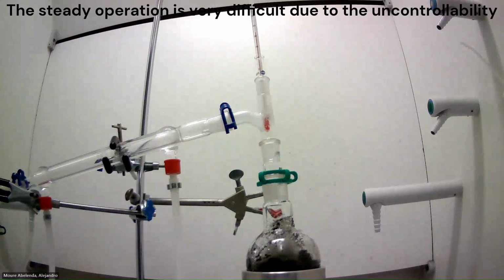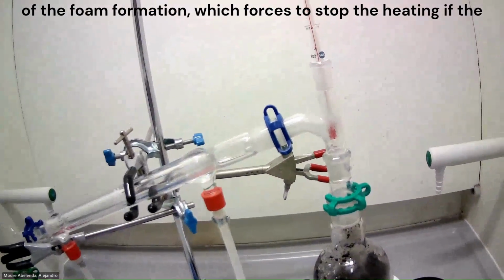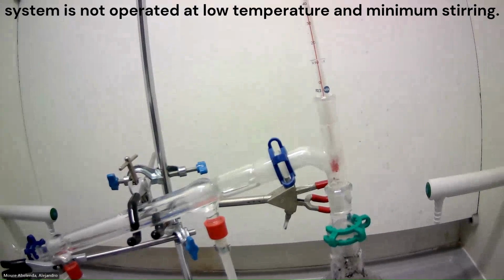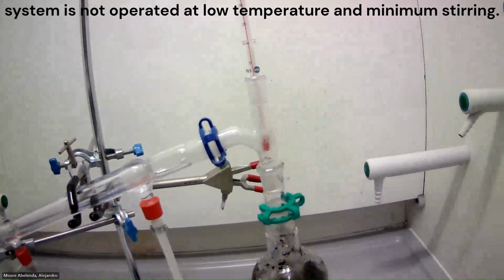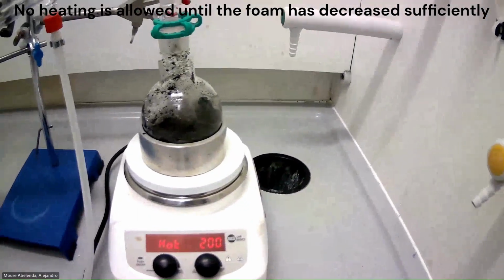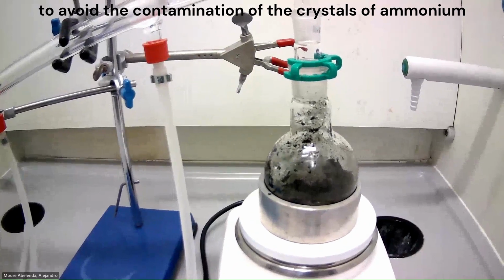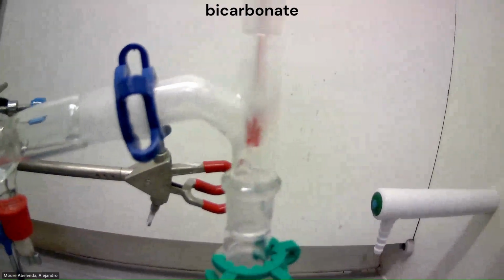The steady operation is very difficult due to the uncontrollability of the foam formation, which forces to stop the heating if the system is not operated at low temperature and minimum stirring. No heating is allowed until the foam has decreased sufficiently to avoid the contamination of the crystals of the ammonium bicarbonate.